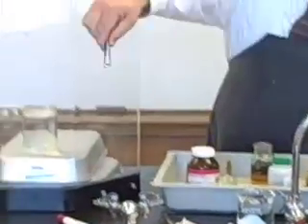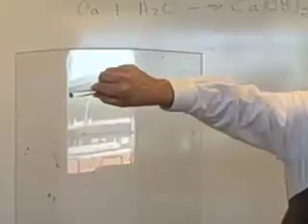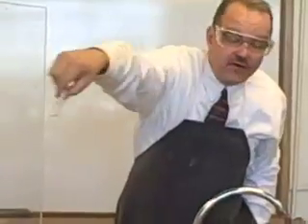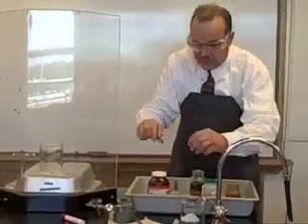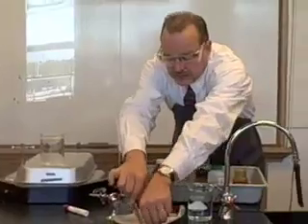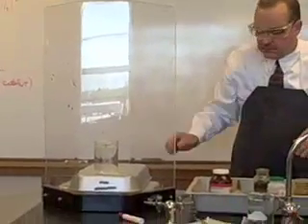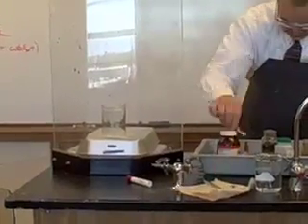This is what the inside of the lithium looks like. You can see that it's pretty shiny in there, like a metal should be. But it's a very, very malleable metal. So malleable you can just cut it. What's malleable mean? Cuttable, spreadable. Easy to spread.